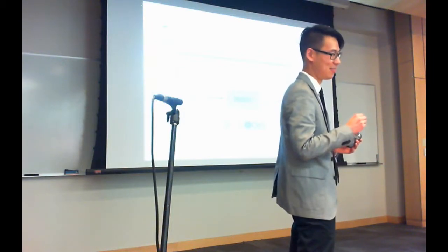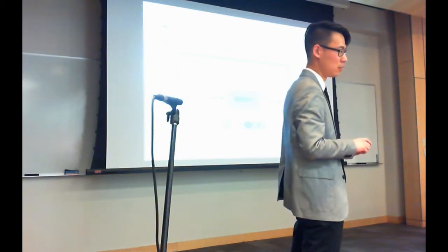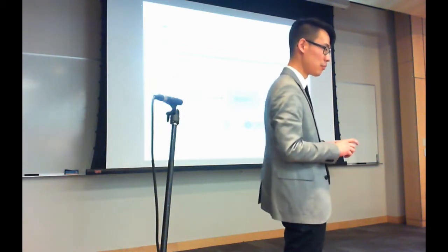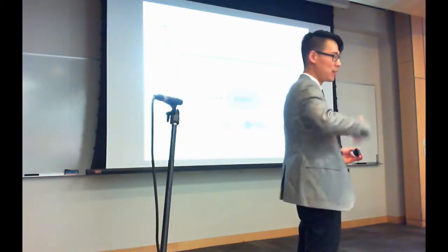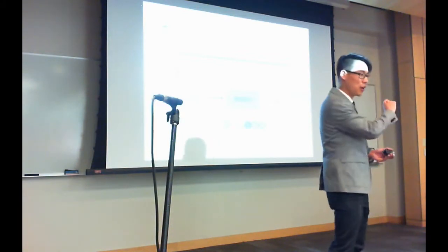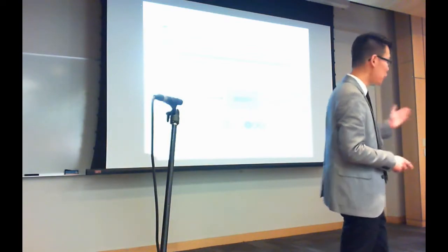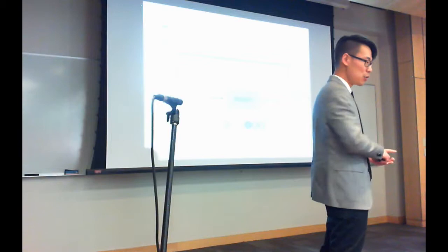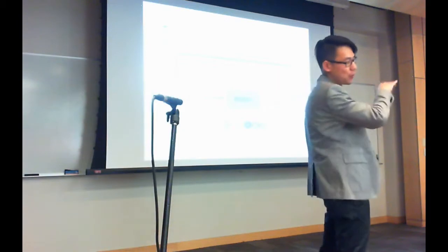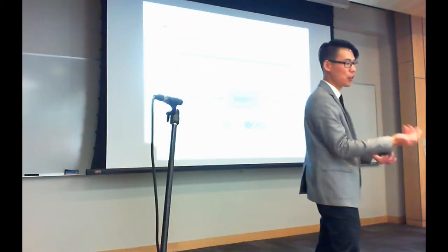I mean, of course you cannot get 0% FDR in theory, but in the existing approach to FDR identification, you can formally talk about 0% FDR. So there's this trade-off between sensitivity and specificity. If we start sliding the scale all the way towards 0% FDR, it's going to cost you a significant amount in terms of sensitivity. So you can do this, but then your library is going to be significantly smaller. So when we talk about these ROC curves for FDR and number of things that are identified, you kind of want to be at the knee of the curve. If we slide it all the way over, your library is going to be puny.